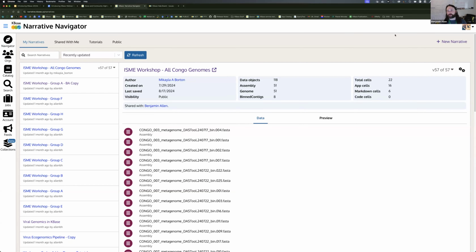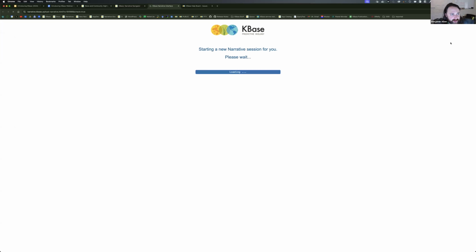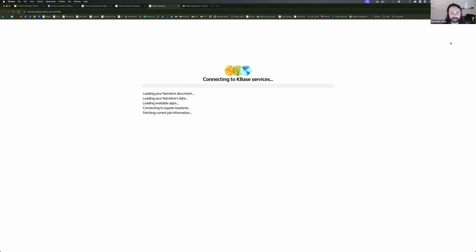What I'm going to do here is go ahead and create a new narrative. In the top right corner, you'll see this new narrative button. When I click that, it will start to spin up the narrative here, and we can begin to demonstrate some of the first steps.